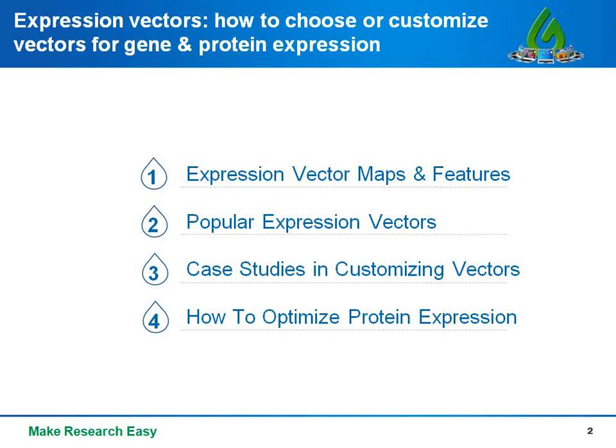Then we'll look at some case studies where researchers have decided to customize an expression vector. We'll look at what they wanted to achieve, how they made their modifications, and how successful their efforts were. Finally, we'll take a step back and look at the big picture of all the factors that influence heterologous protein expression so that you can see how vector selection fits into your larger workflow.